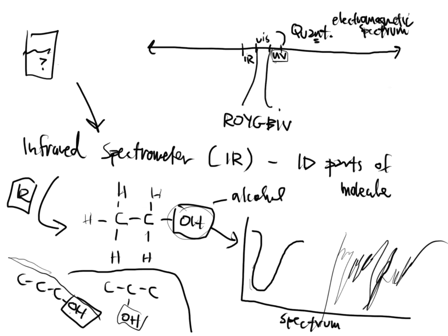And for us as an analyst, we can't really look at that and take anything away from it. We're not that good. I don't care how many years of infrared spectroscopy experience you have in a lab, you will probably not be able to look in that area that we call the fingerprint, that is very unique to every single compound. It's not going to work. You're wasting your time. You can tell me it's got an OH group, but you can't tell me if it's ethanol or propanol or isopropanol or any of the other alcohols for that matter, unless you use it all the time.